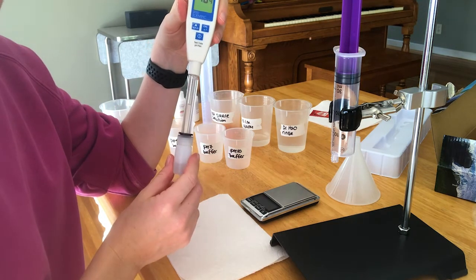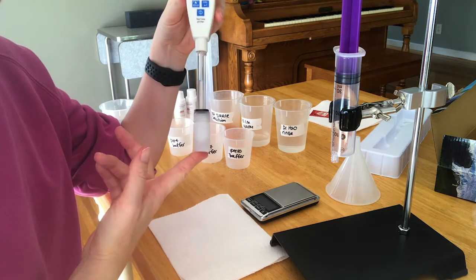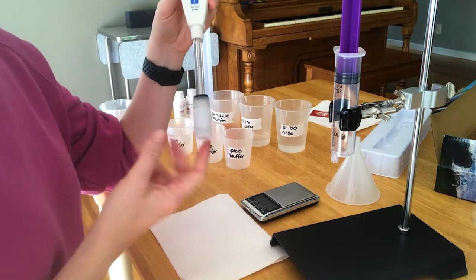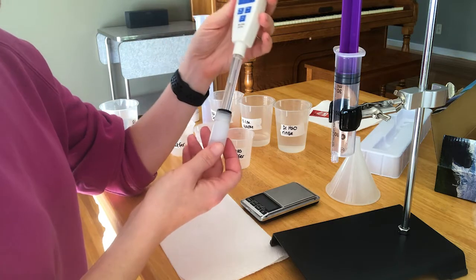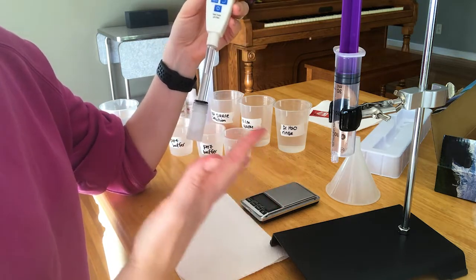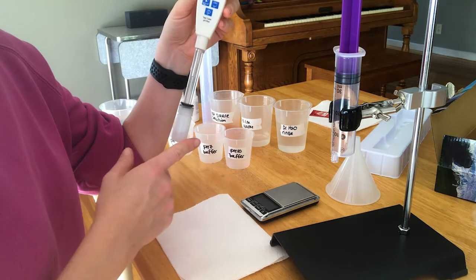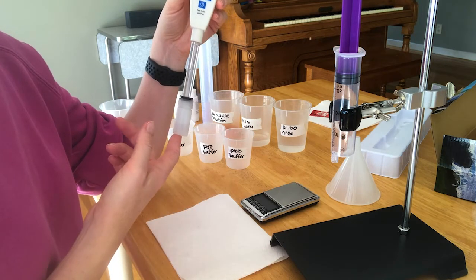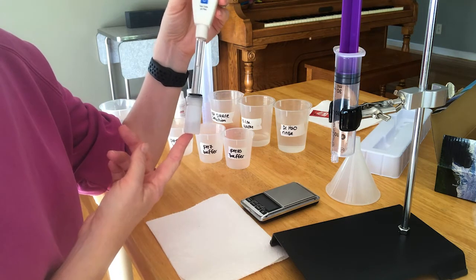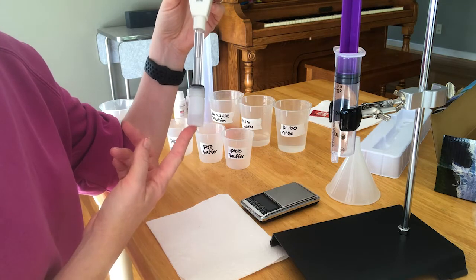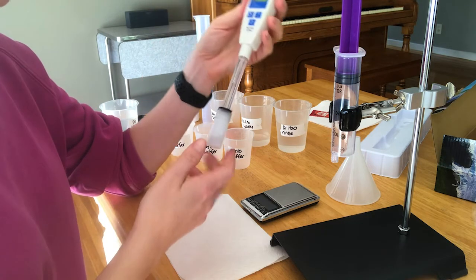This pH meter has a glass bulb which is porous and needs to be stored in this salt solution at all times, except for when you're using it. You don't want it to dry out. If for some reason it was laying out, it needs to soak in this salt solution for at least 10 minutes before you use it.